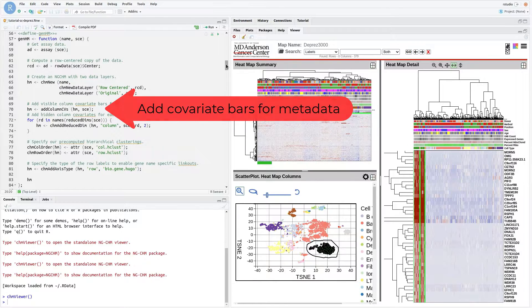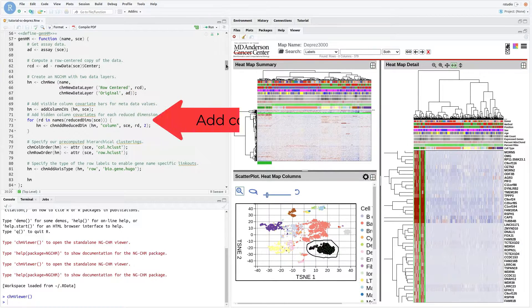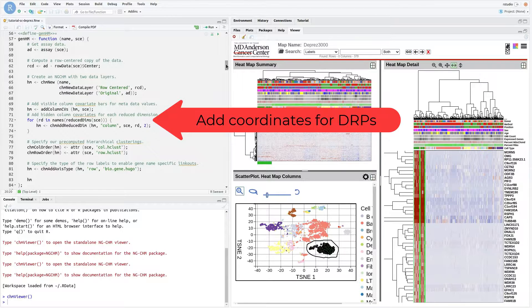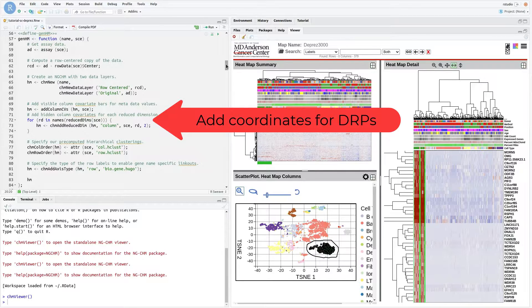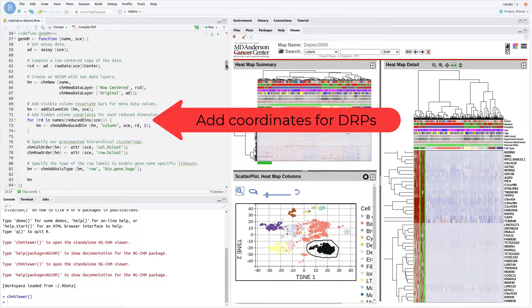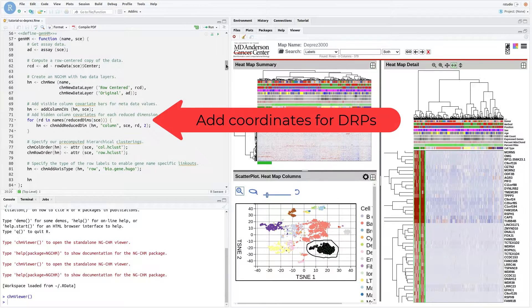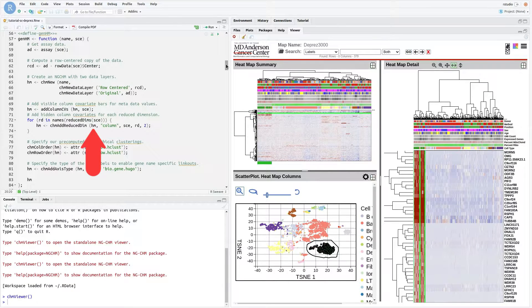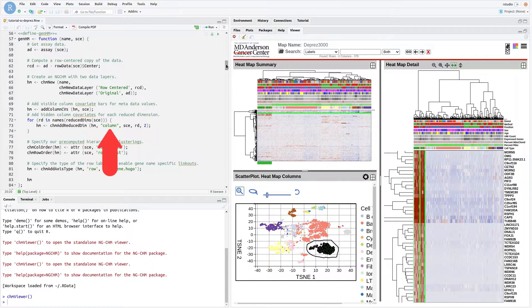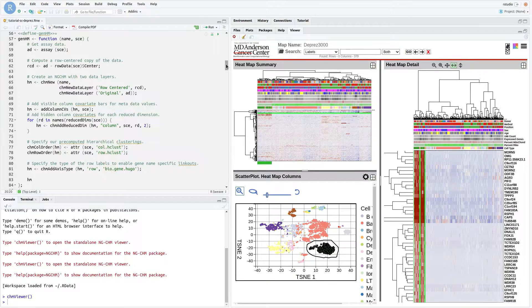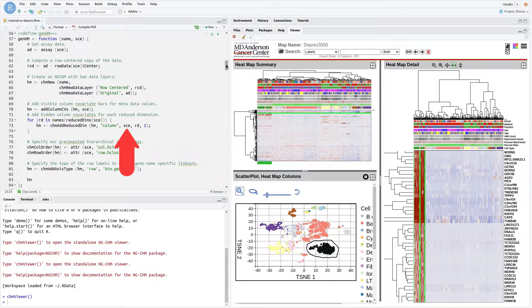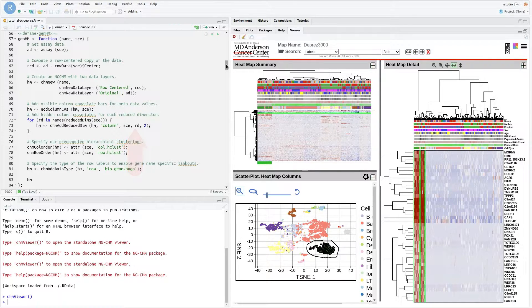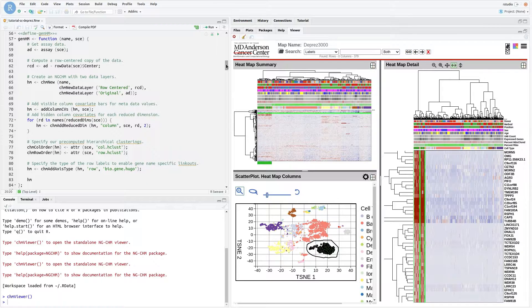Add hidden column covariates for each reduced dimension contained in the single-cell experiment object. The function chmAddReducedDim is a new function in the NGCHM R package that adds a reduced dimension attached to a single-cell experiment object to an NGCHM. Its parameters are: the NGCHM, the axis to add the dimension data to, the single-cell experiment object, the name of the reduced dimension data to add, and the maximum number of coordinates to add.